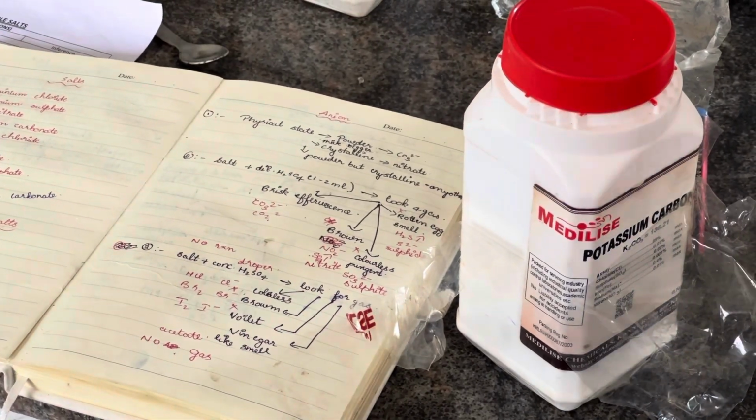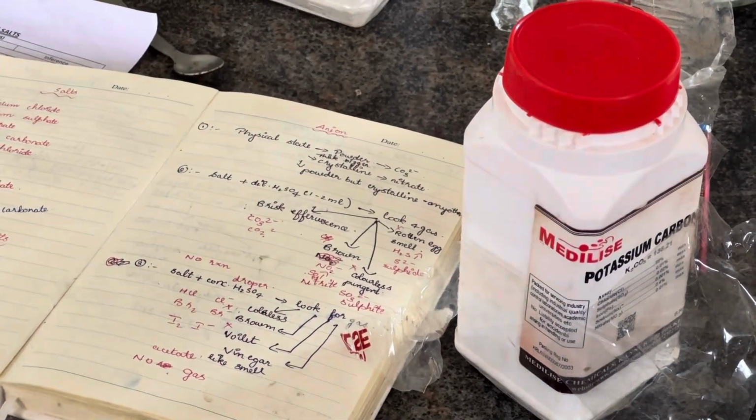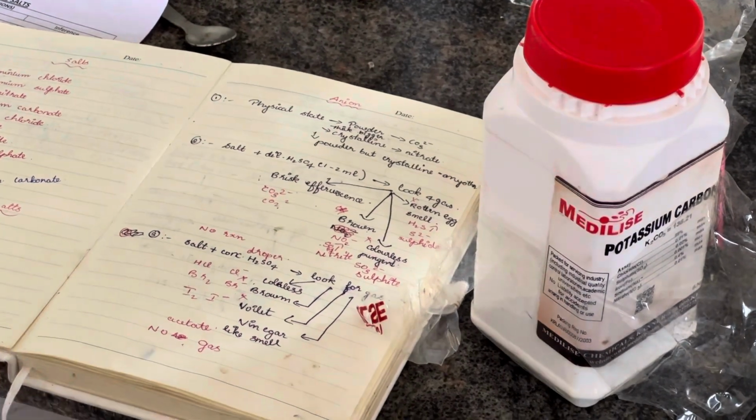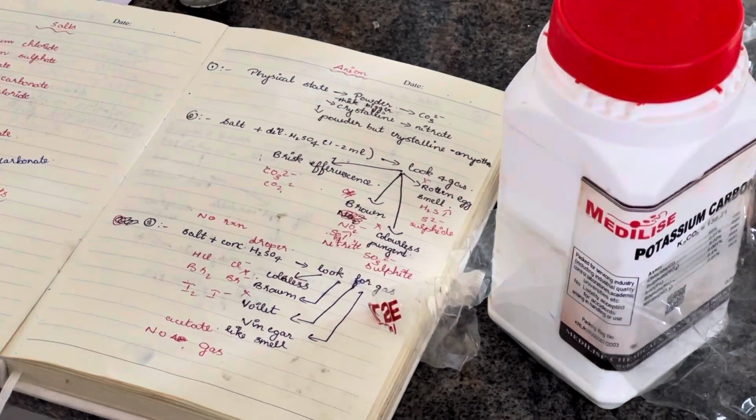So in today's class we'll be learning about the analysis of the anions. In chemistry practicals you will have to analyze the different anions as well as the cations present in the given salt. So here you have to analyze the cation as well as the anion separately.